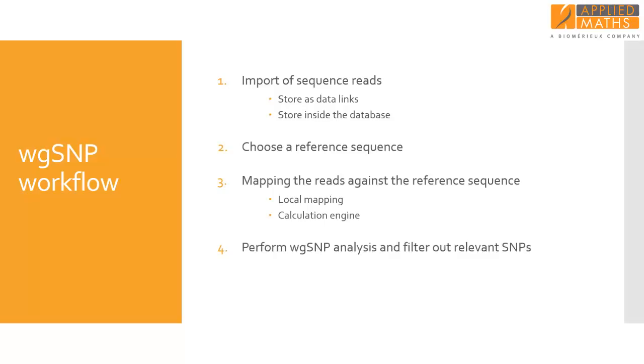In the actual SNP analysis, the sample sequences obtained in the previous mapping step are compared to the reference sequence and the base differences are recorded.